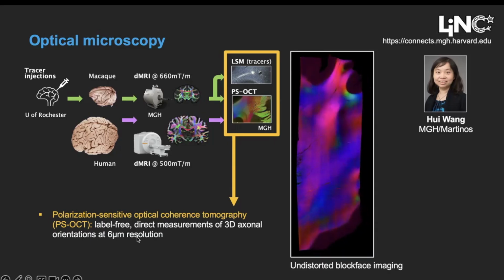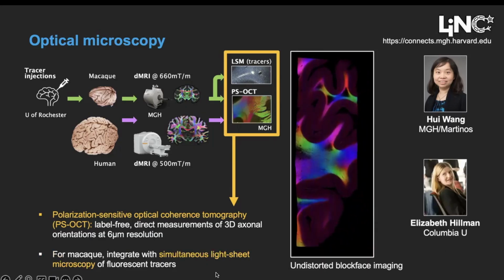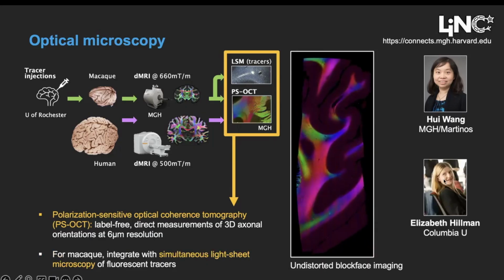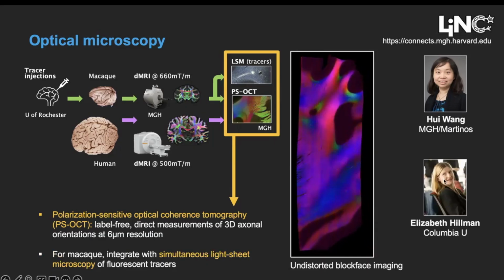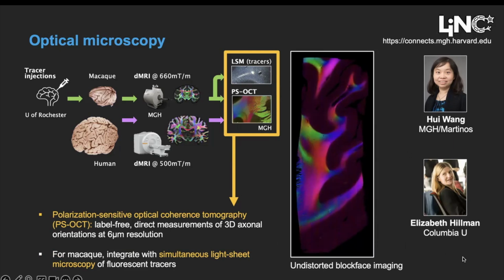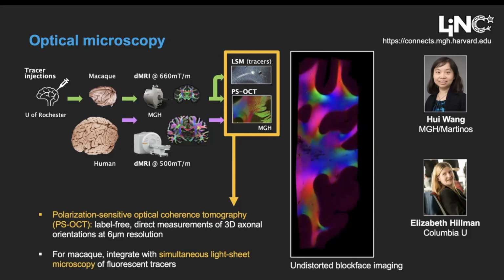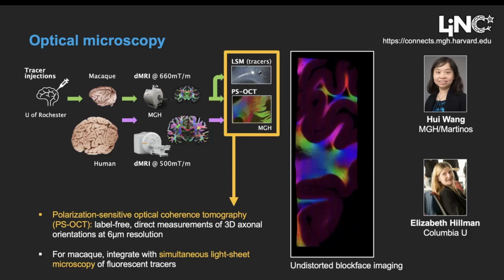However, this does not get down to the single axon resolution still. And so that's where Elizabeth Hillman comes in. Particularly for the macaque, the block face imaging is going to be integrated with simultaneous light sheet microscopy to image the fluorescent tracers that are going to be our ground truth in the macaque.